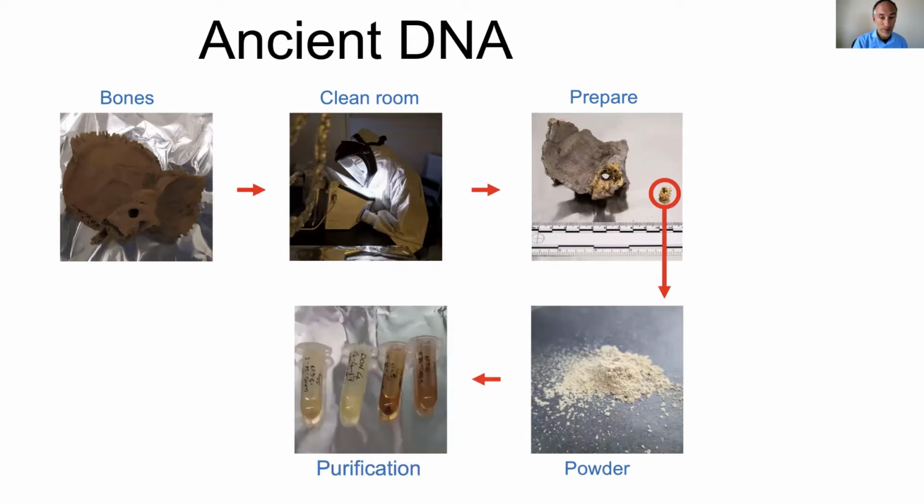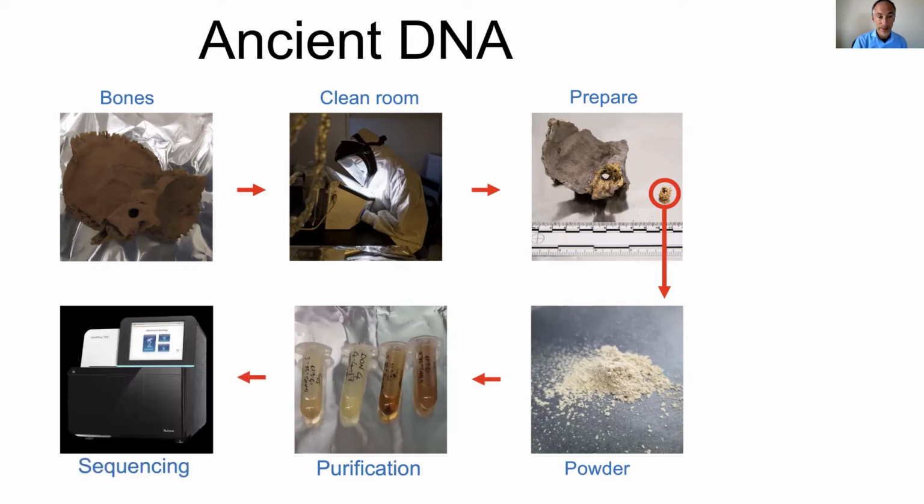We remove and extract the DNA sequences with a DNA extraction protocol that's optimized to remove inhibiting substances as well as the protein and mineral content. And then we make a double or single-stranded library for Illumina sequencing, and we sequence it in one of the high-throughput sequencers that have greatly reduced the cost of sequencing.